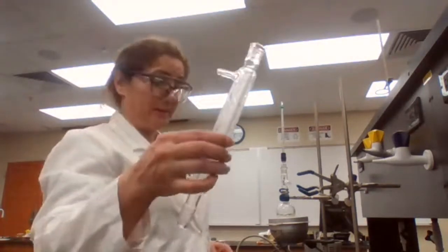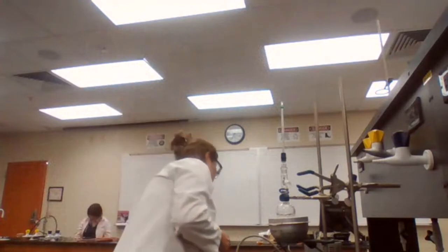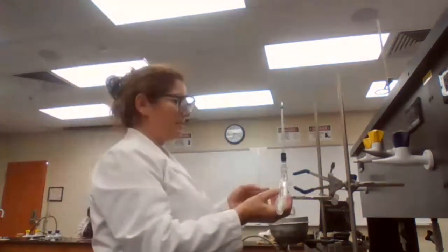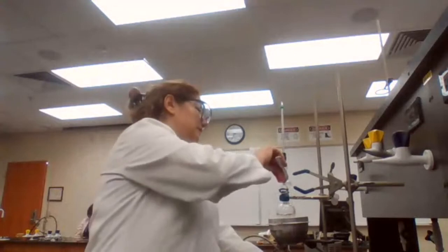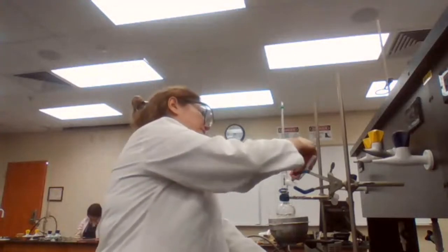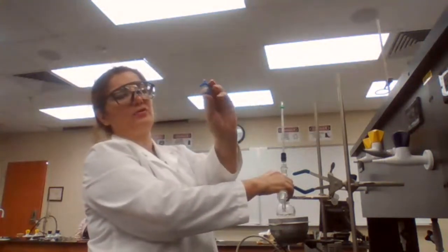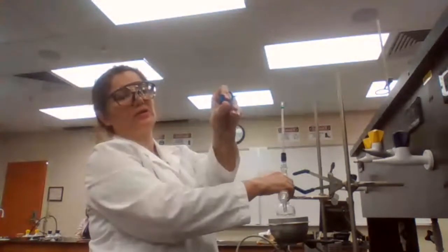A condenser. The condenser is going to be attached to the distillation head. Your distillation head, or the glass joint again, needs to be greased. And the distillation head is attached to the condenser. And right away, you would use the blue clamp. It has like two rings, small and larger.